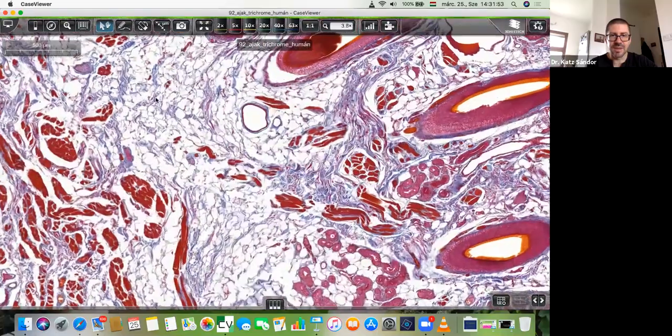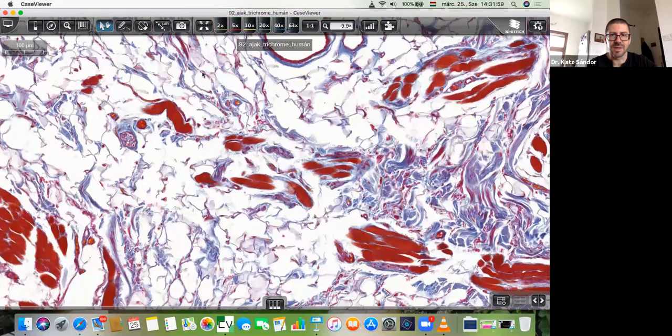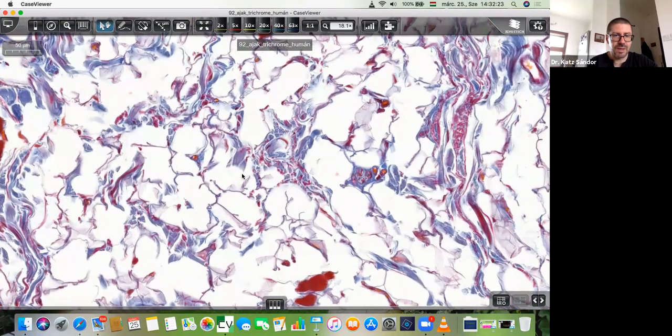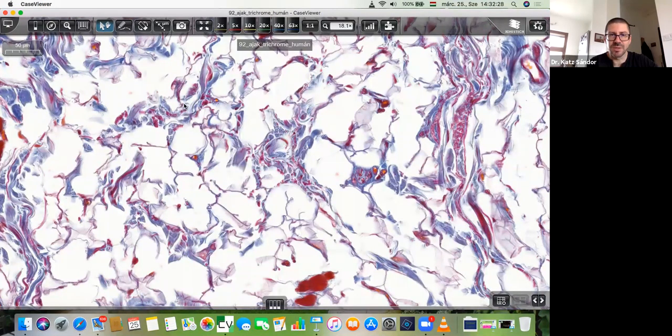Just looking at this area, here we have the connective tissue, mainly adipocytes. This is a typical, nice one. Here we have the places for the adipocytes, but after the routine histotechnique, the fatty components are dissolved. Therefore, we can't see the fat itself, we can just see the exact place for the fat, the place for the adipocytes. What was the blue stained thing? The blue connective tissue, collagen fibers. These blue and purple are collagen fibers.